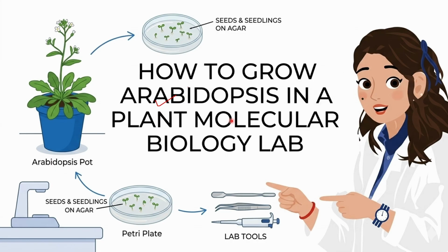Because a single stressed plant can introduce enough noise to ruin weeks of your delicate lab work. So we will walk through the life cycle of this model organism from a dormant seed to a successful harvest, ensuring that all the plants are as robust as the data that you're trying to collect. So let's dive into this.